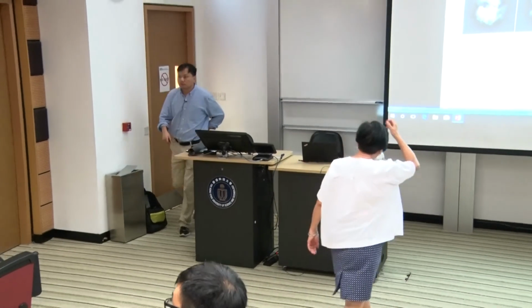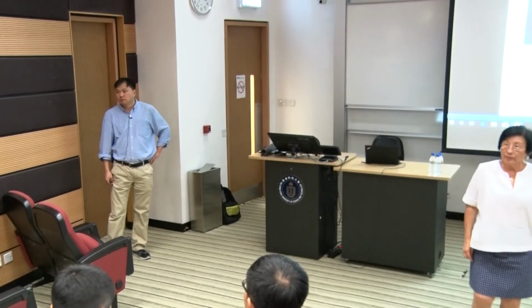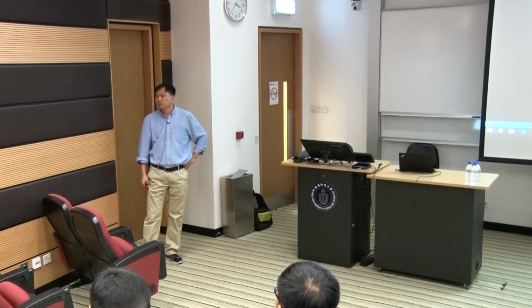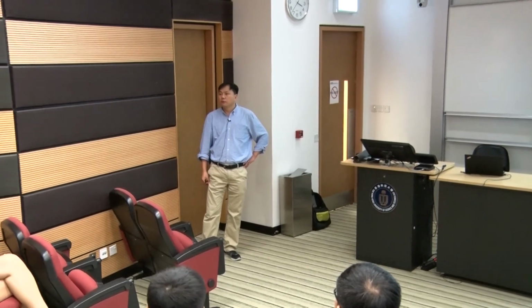I have a question from machine learning, maybe. When you mentioned particle picking, is it easy to get labeled data to just judge whether the window contains a particle or not? What do you mean by labeled data? In machine learning, people use ImageNet to ask whether the image contains a certain object like a cat or a dog. Those are natural objects, very easy to judge for common people. They just go to the internet and use crowdsourcing to put a label. But for this very specific kind of image, is it easy to get such labeled data?